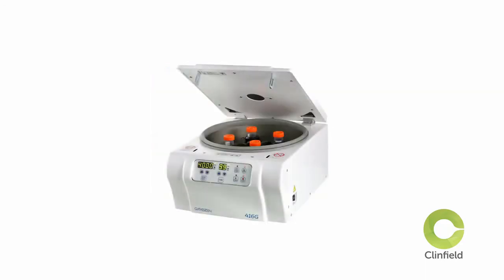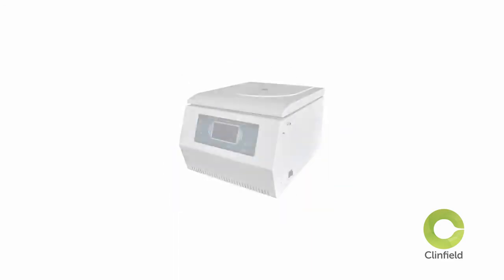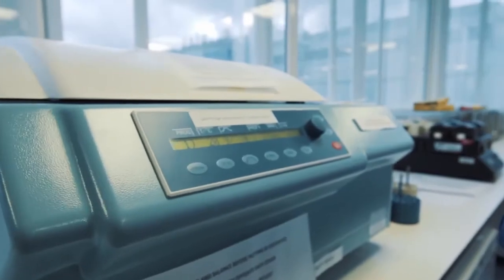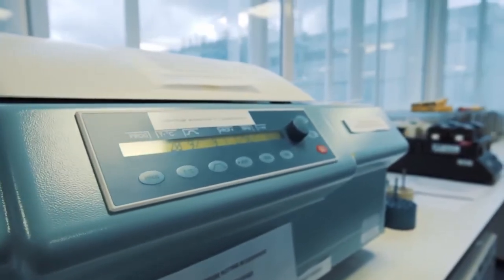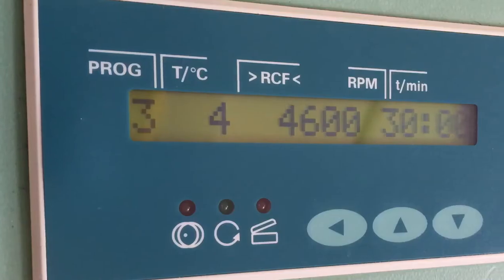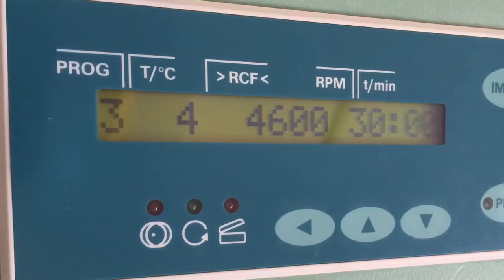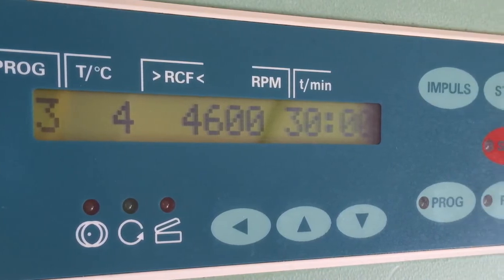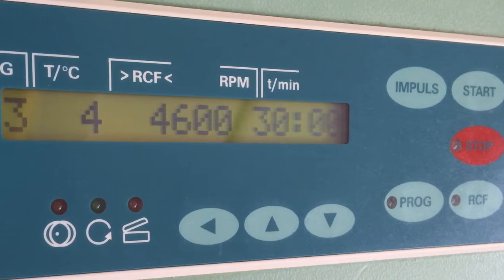If a protocol refers to RPM, it should also name the type and size of the centrifuge to be used, since the G-force generated during spinning will be quite different for a given RPM setting in a small centrifuge when compared to a large centrifuge. This could be very important if samples are being processed for the same clinical trial in many different centers where each laboratory has a different type of centrifuge. If the protocol requires the centrifuge to be set at a certain G-force and this can be done on the controls, then do so.